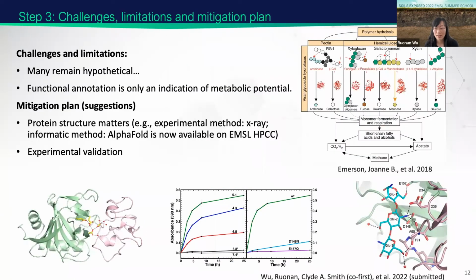Okay, challenging part again. There are still some limitations and challenges remaining to detect other metabolic functions carried by viruses. One challenge is at the functional annotation step. From my own experience, sometimes nearly half of the genes called from the viral genomes are hypothetical. So we're still leaving many of these viral genes unclassified. Our knowledge of viral genomics is still lacking.